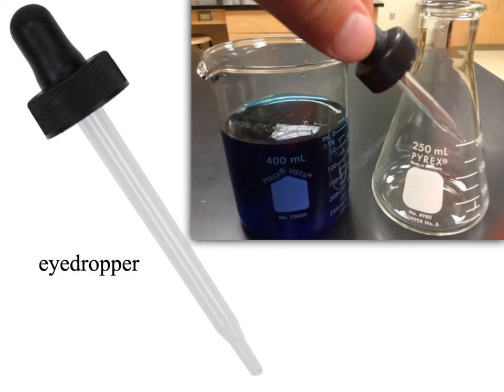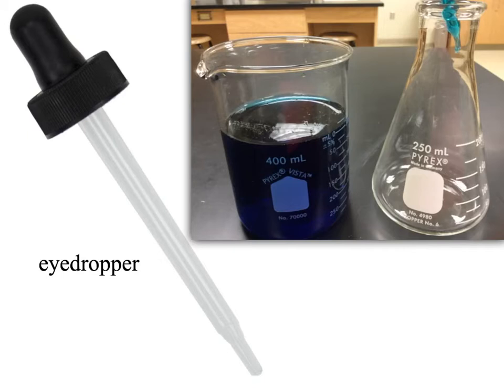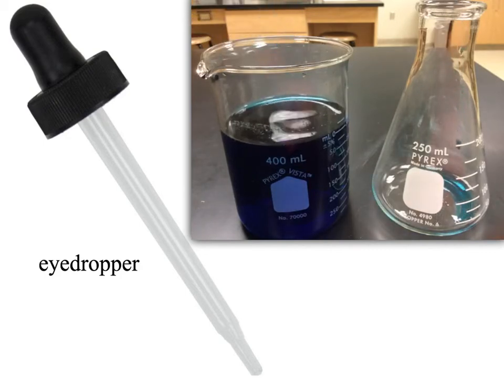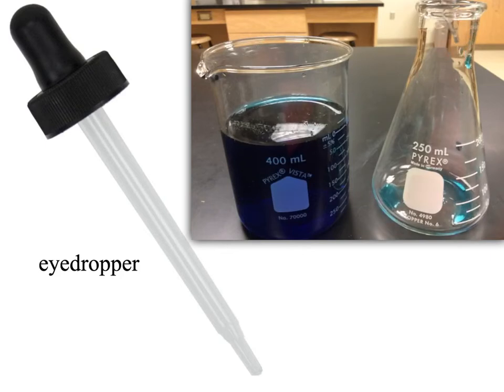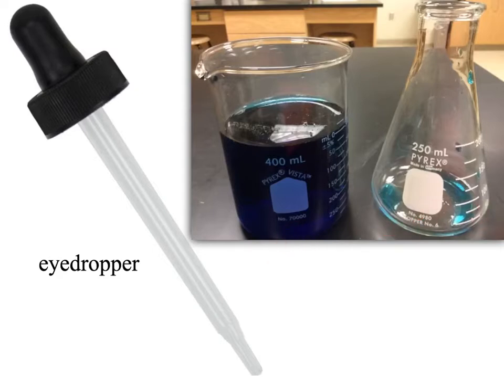The next piece of equipment is an eyedropper. Their function is to transfer liquids from one container to another — just like you might use a turkey baster. You squeeze the air out, insert it into the liquid, release the pressure so the liquid goes up, move it to the next container, and release. Quick review: the container I'm taking liquid from is a beaker, and the container I'm putting it into is an Erlenmeyer flask.